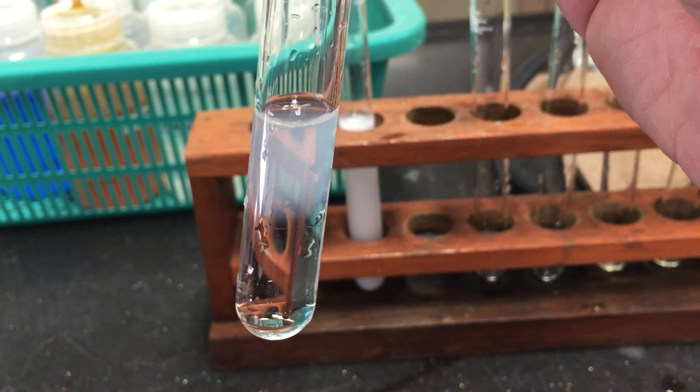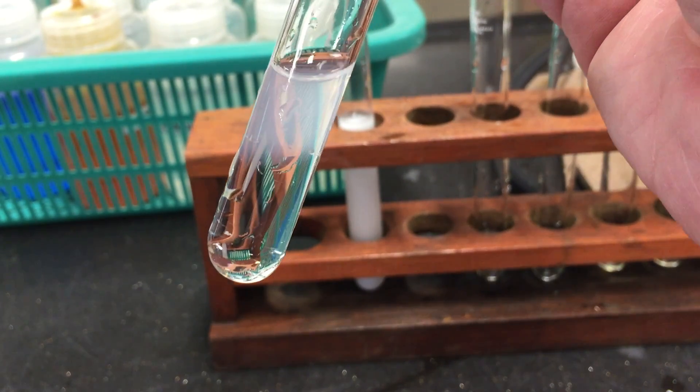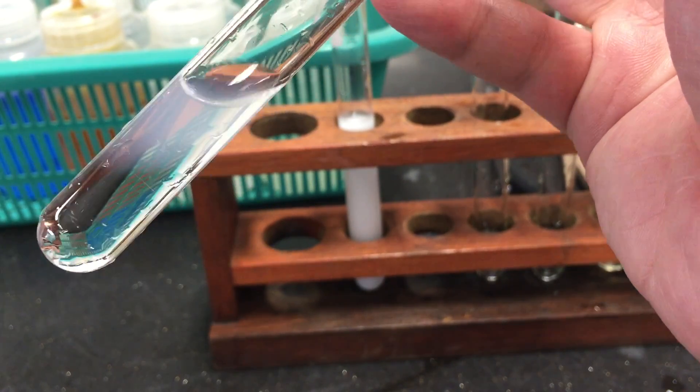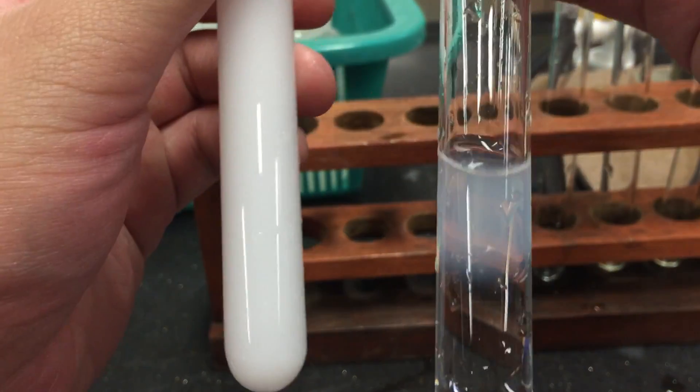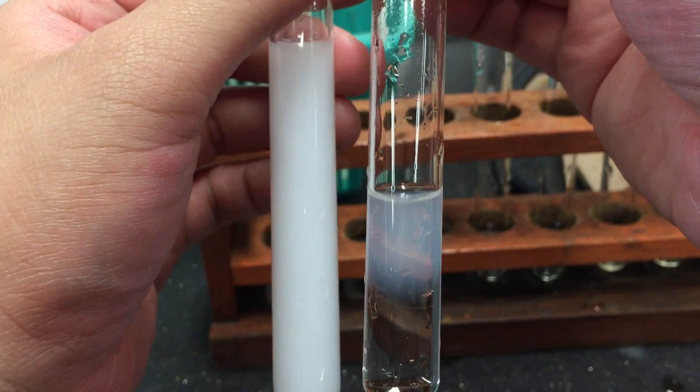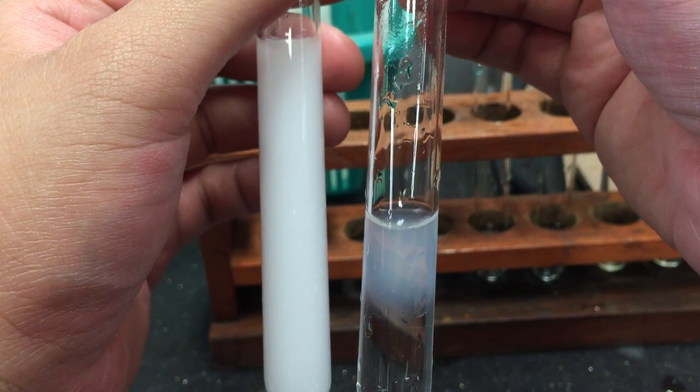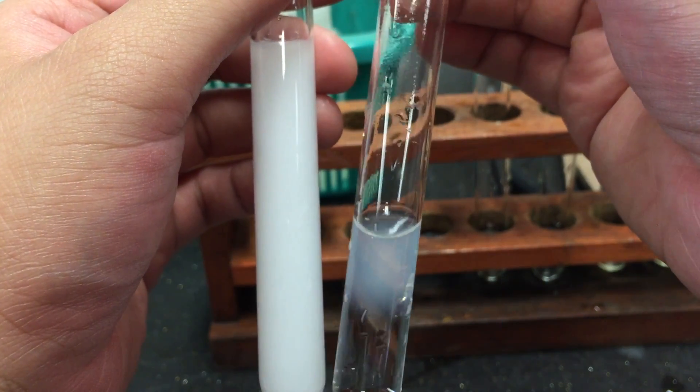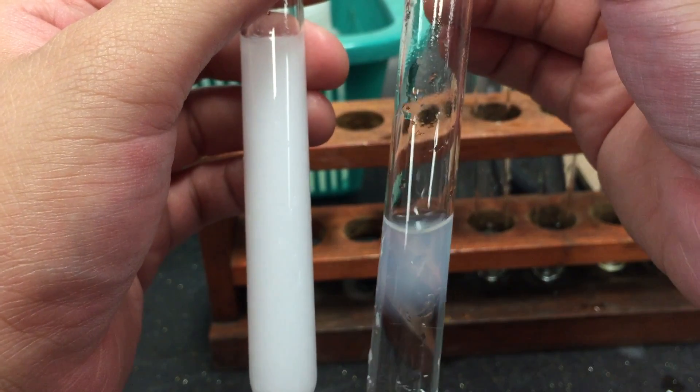We can compare this precipitate with the precipitate we obtain from the addition of sodium hydroxide. Notice that this faint white precipitate is not as dense as the white precipitate obtained from the sodium hydroxide experiment.